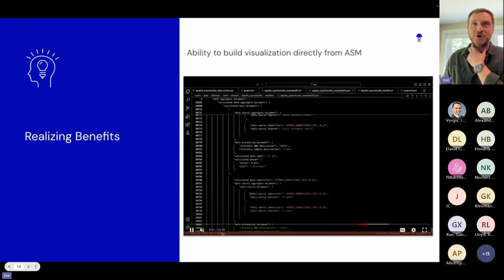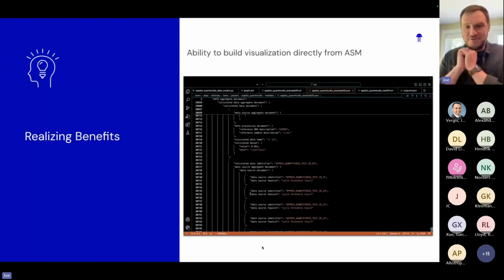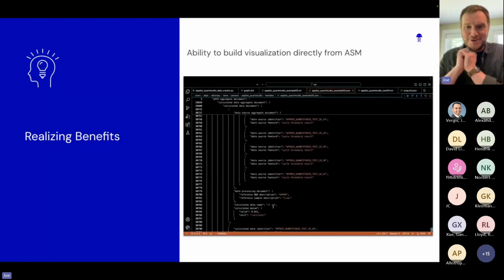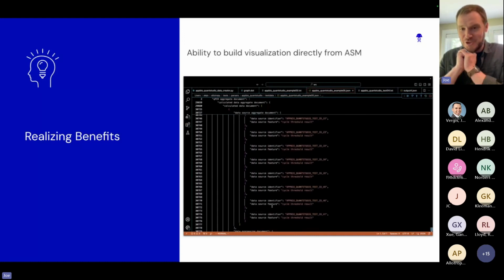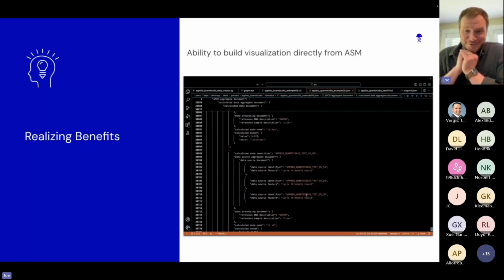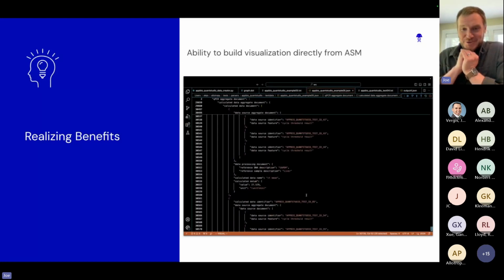But as you can also see, a given file might end up being 30,000 lines or so. So even though one of the virtues of the ASM is that it is human readable, there's a limit to what is really human readable once you get to a certain scale.